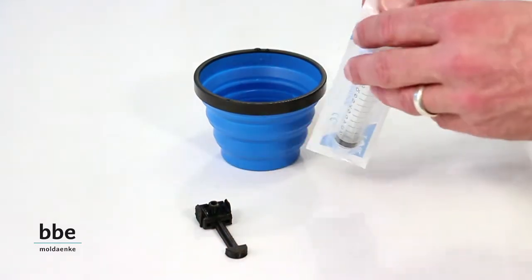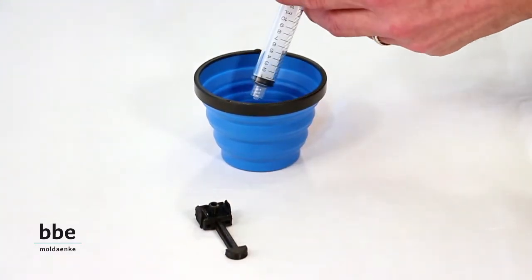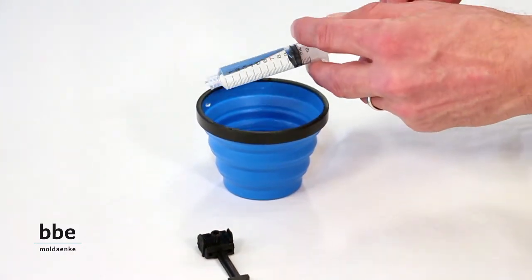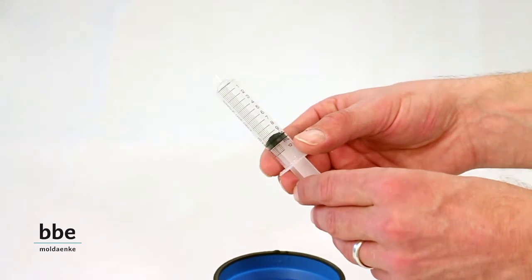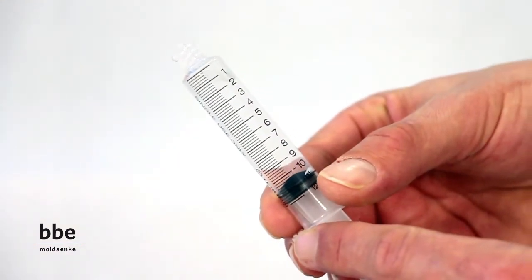Using the syringe, take a 10 milliliter sample from the cup. Additionally leave one milliliter of air to avoid dead volume during the filtering.